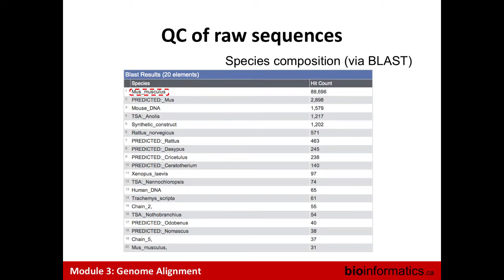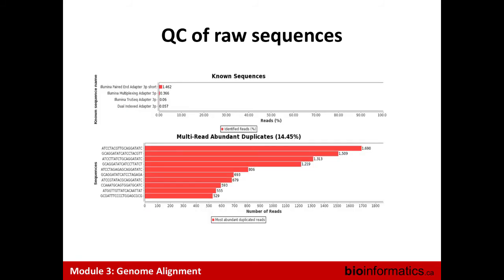Or even like cancer data, that duplication? No, because we don't talk about biological duplication. It's technical duplication. But it can manifest here, like if you have a piece in the genome that's duplicated, you will get it, right? No, because what we count is really the same read of the same fragment.